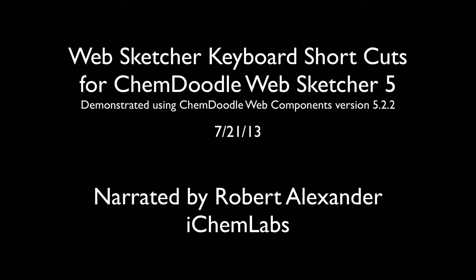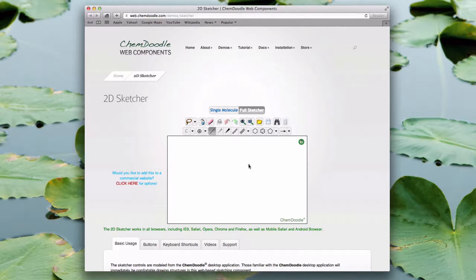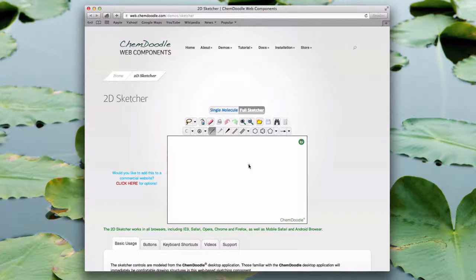Hi, I'm Robert Alexander from iChemLabs and this is the ChemDoodle WebSketcher keyboard shortcuts tutorial for ChemDoodle WebSketcher version 5. In the WebSketcher advanced tutorial I showed how you can adjust the size or angle of a drawn structure using Shift and Alt respectively. In this tutorial I will demonstrate the remaining keyboard shortcuts while creating a complex structure, Viagra.